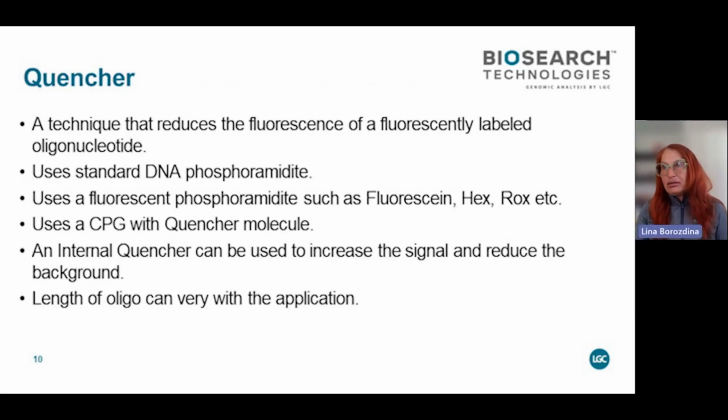What is the quencher? This is something that people constantly ask. A quencher, when paired at a specific distance with a fluorophore, kind of shadows it over, so fluorescence is reduced or non-existent. But when you separate the two, the fluorescein lights up. This is a very commonly used technique in diagnostics.